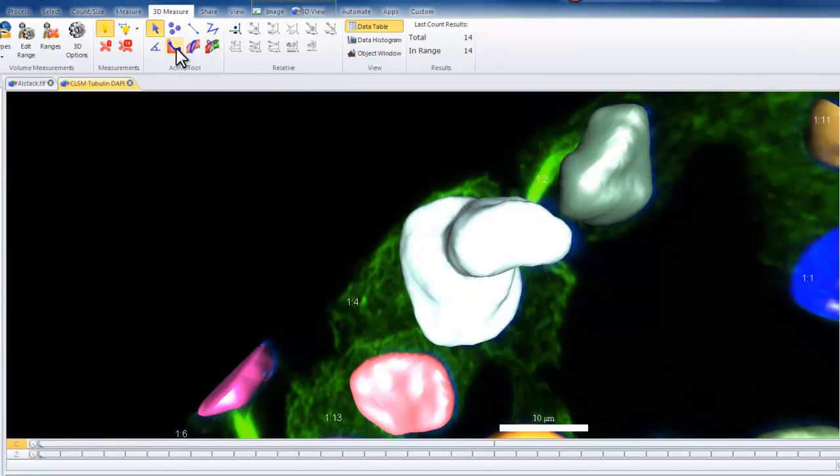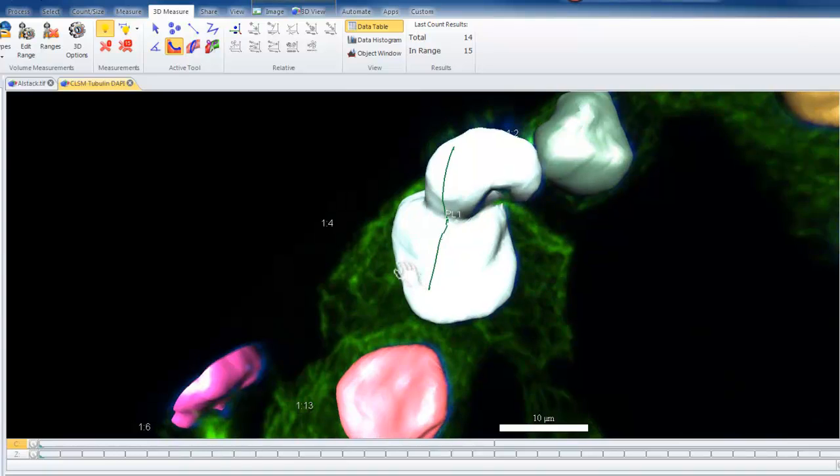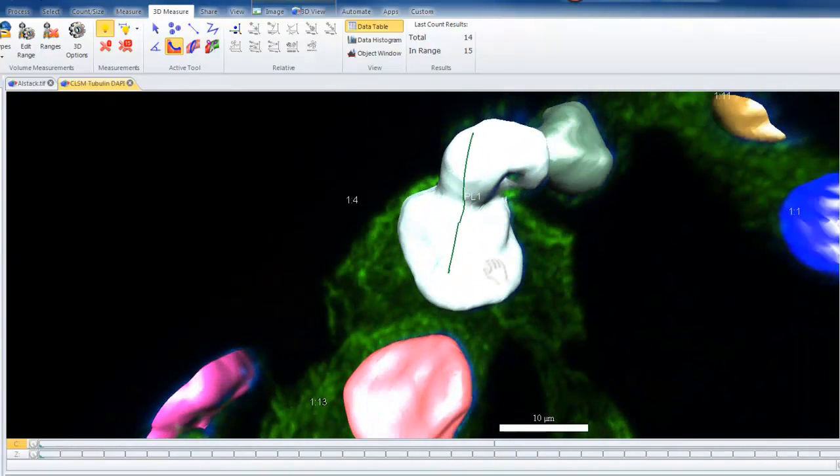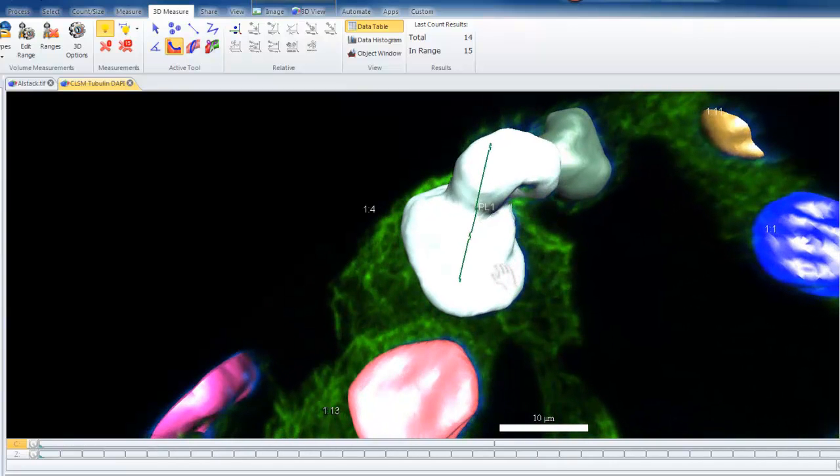and use one of my active tools called Add Curve. Using Add Curve, I can click perpendicular to the perspective of my object, and I can click 2 different points, creating a linear distance between them. If I use my View navigation tool and turn this sideways a bit, you'll see it actually followed the edge of my surface that I've created to give me a value of linear distance along the surface.